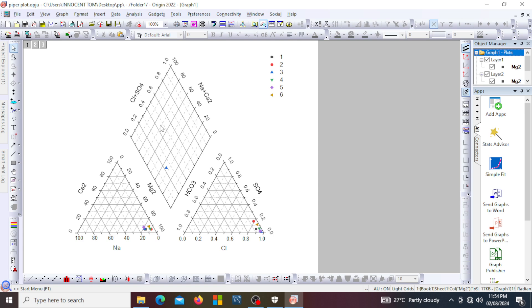Then you have the diamond-shaped field in the center showing the concentration of all these components — your cations and your anions. The Piper plot is usually useful to identify water type — whether it is fresh, seawater, or brackish — and also for determining the dominant ions in the water sample, which we are going to show in this video.